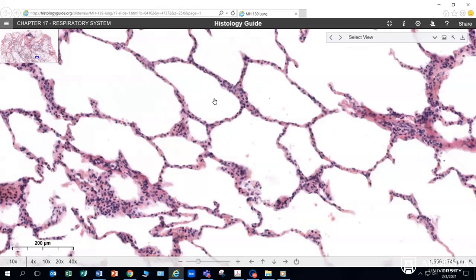And what's inside of this white structure, that's an air sac inside the lung, is air, room air that we have inhaled. If we were looking at adipose tissue, there would be a large cell with only one nucleus on one side. So you're not going to see this darkly staining nuclei surrounding the entire white structure. So this is simple squamous epithelium.